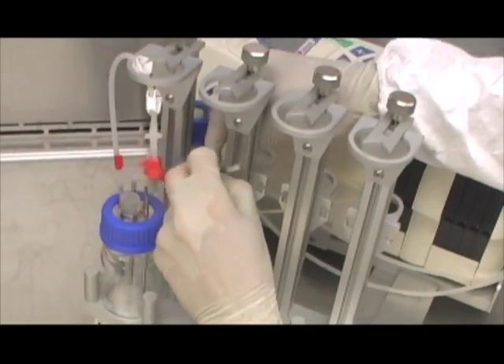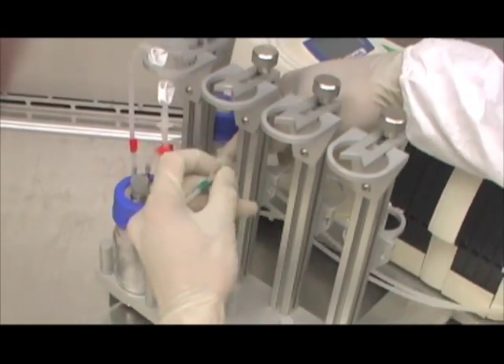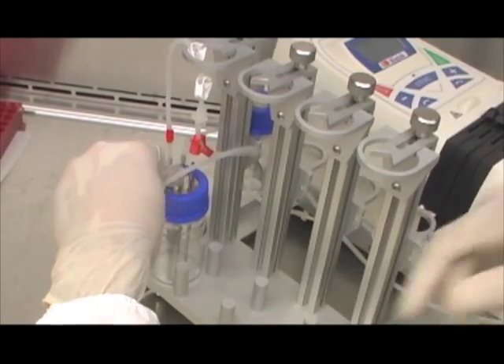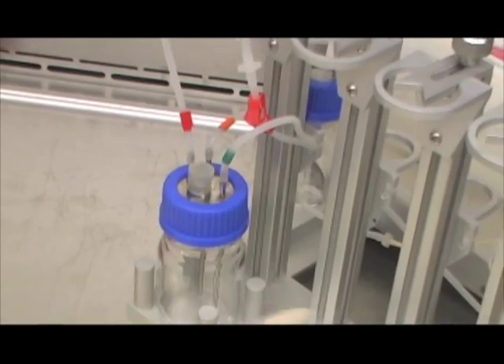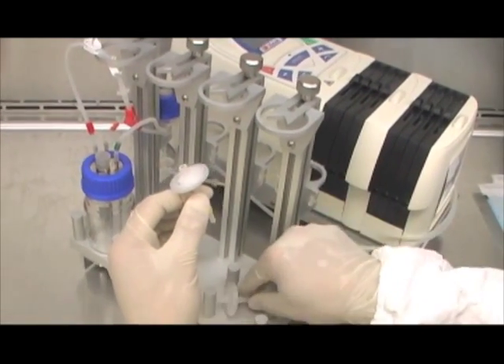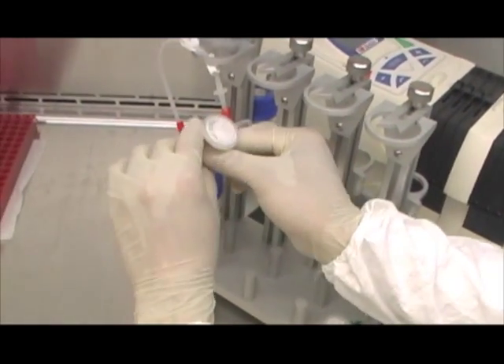Secure the tubing using the right hook and press-fit it on the metal peg with the letter G for green. This completes the assembly of media and gas perfusion tubing sets. As a last step, place two air syringe filters with their respective color-coded tubing — yellow on the media reservoir and green on the humidifier bottle.